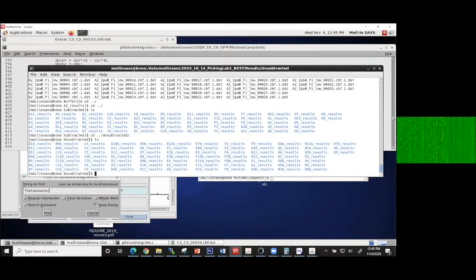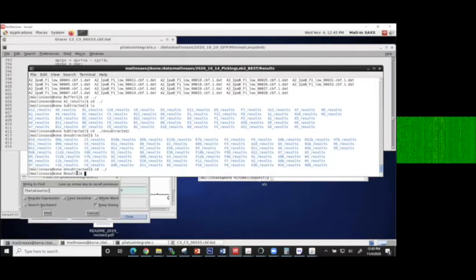they'll enable you to do the subtraction on your own. So you can subtract the buffer curve from your sample curve on your own. But usually we would recommend using the subtracted variants if they're looking good, unless you're doing something weird. And again, I think I remember from the Hackett lab that they put a different buffer in buffer 1 and a different buffer in buffer 2, and they're doing some funny subtraction there. So the unsubtracted files allow you to do that. All right, so that's that.